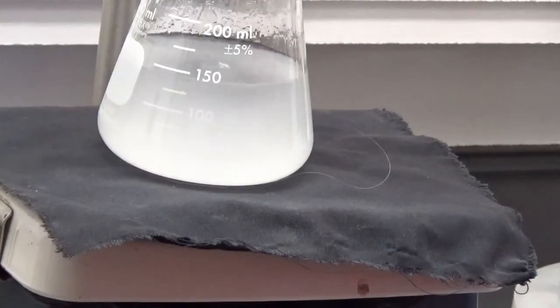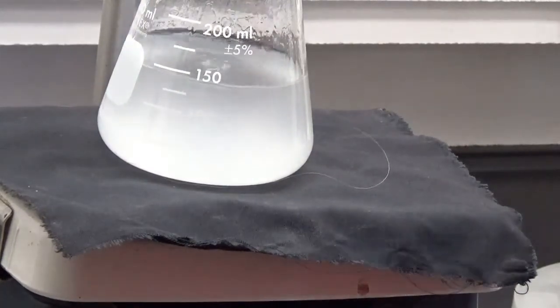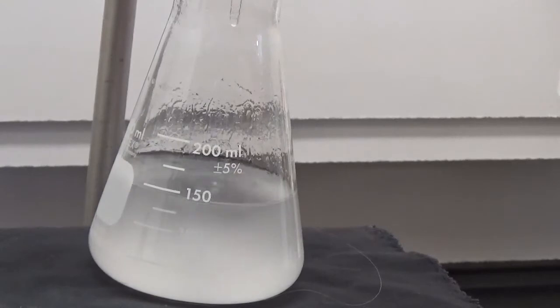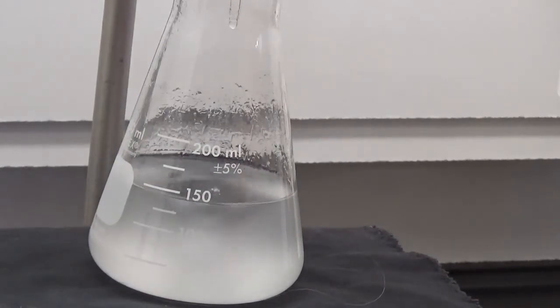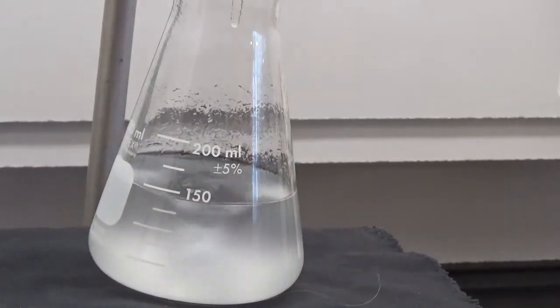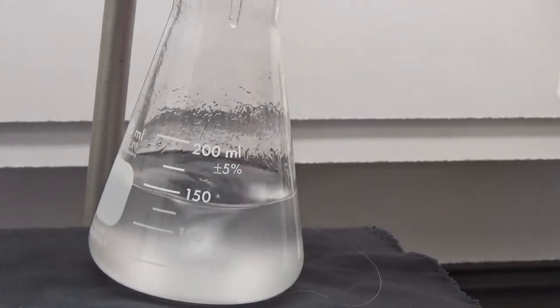Acetic acid being added. Add it a little bit. Clearing up, but not there quite yet. 1 or 2 more drops.